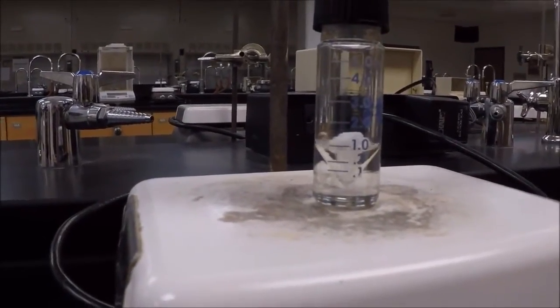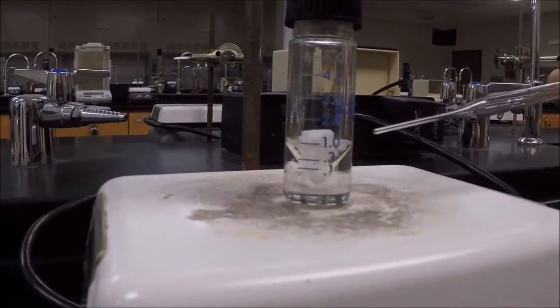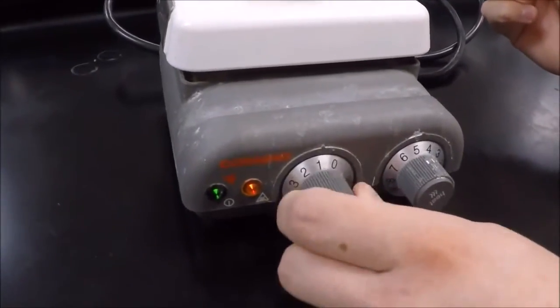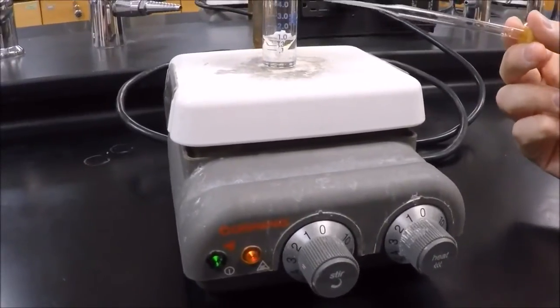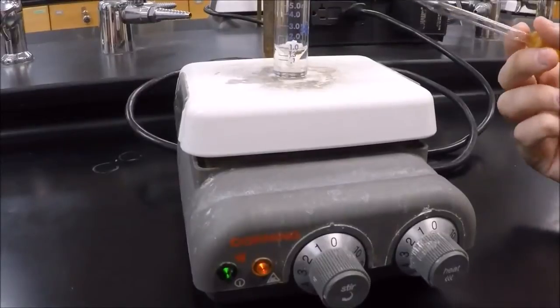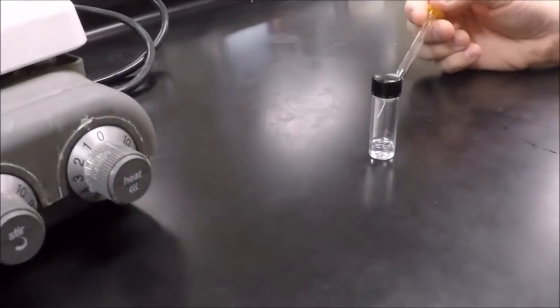We know we're pretty much done now because we have about one milliliter left of solution. At this point, hopefully that's all just toluene, so we can turn off the stir, turn off the heat, and let this settle. Then we screw this off — this is our pure toluene, and in the vial is our pure hexane.